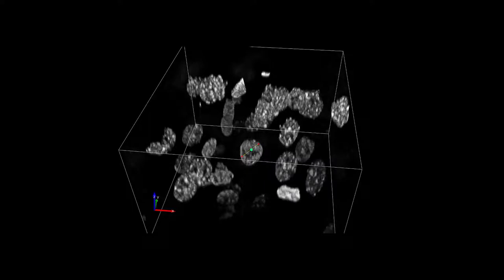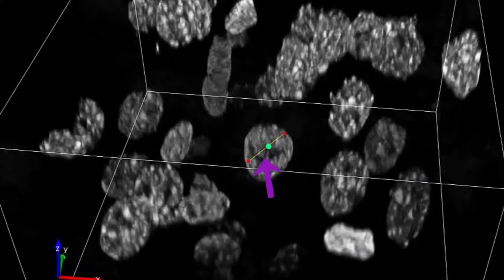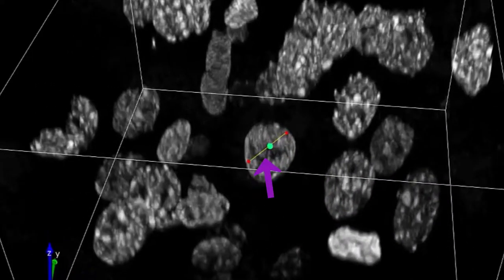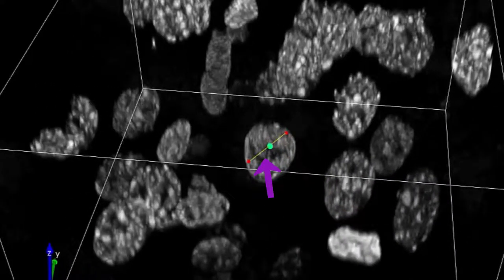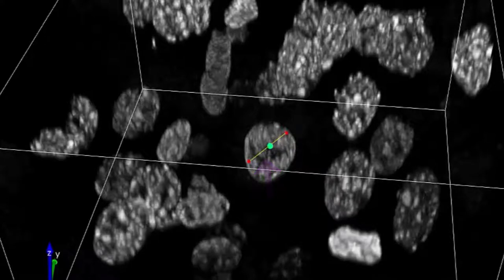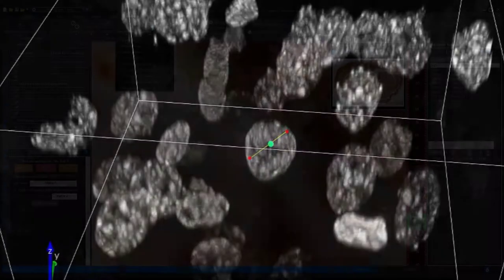Once the middle of the cell is selected, a line will appear. On this line, you will mark the boundaries of the cell, helping to estimate the volume of the cell.